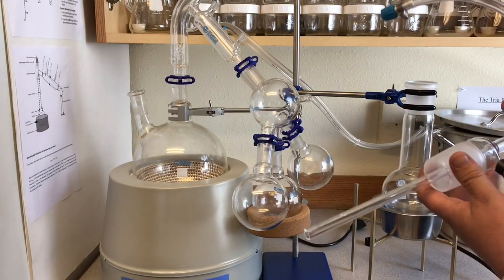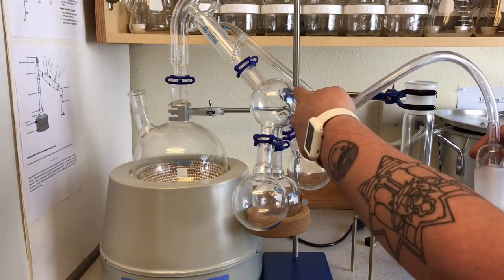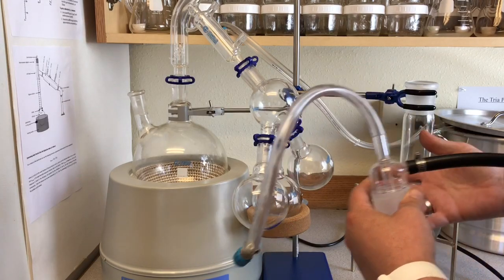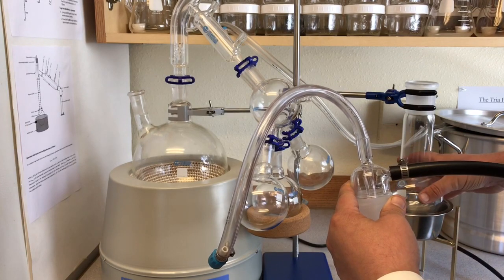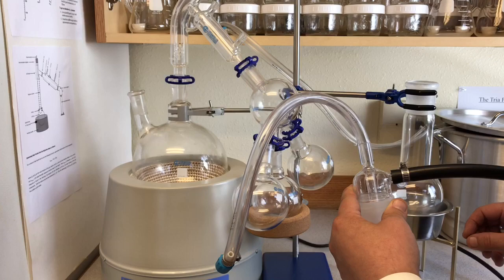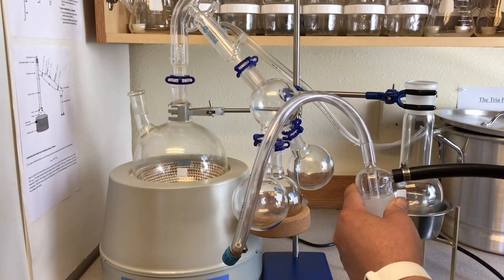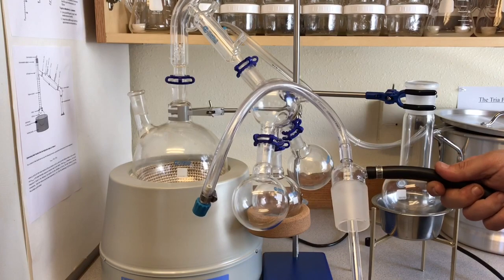So this is the inner part of our cold trap, and basically the vacuum will come out of our distillation set, will come down this tube, and any liquids that might go into your pump and damage your pump are going to stick to the walls of your cold trap as condensation, and you're going to be pulling cold fresh air from up here on top. So the colder that your pump runs, the more efficient that your pump is going to run.